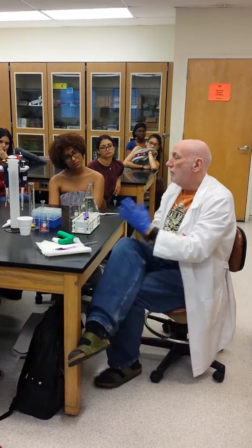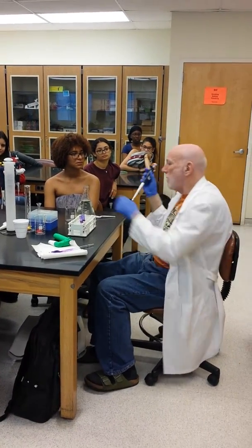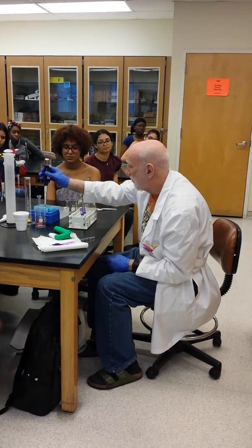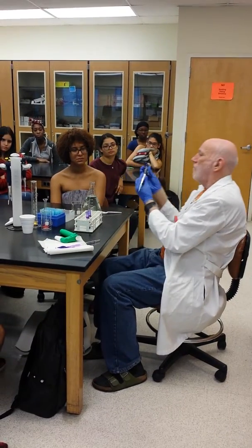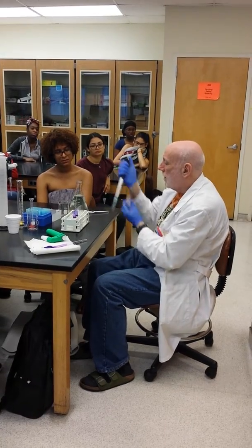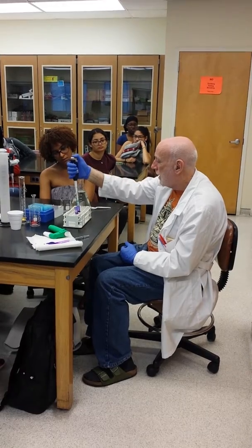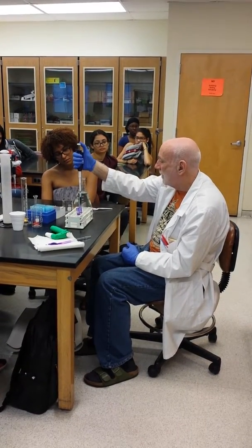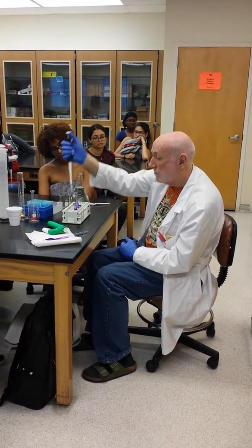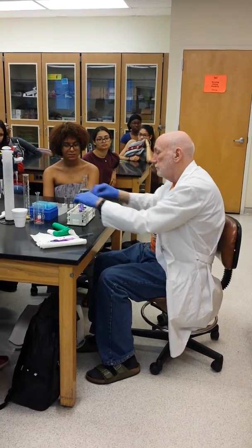I'm going to switch instruments now. You're all going to get a chance to play with these during the semester. This is a micro pipetter. And I have to be careful about changing the tip. This I've already adjusted. It's measuring out exactly 1 milliliter. So I have another tube here. This I want to press down. There's a stop point. I'm going to pull it up. There is exactly 1 milliliter here. And that goes in there. Now I'm done with this tip. I'm not going to reuse it.